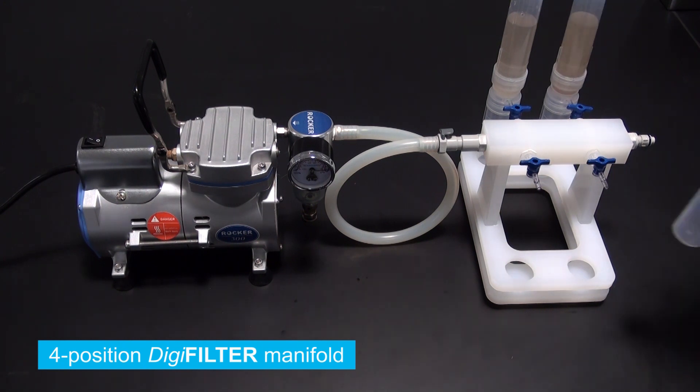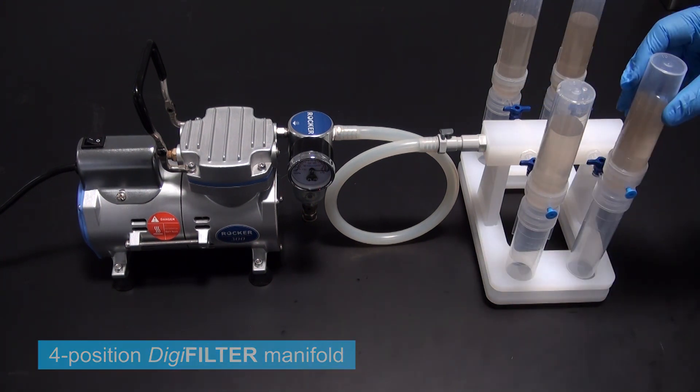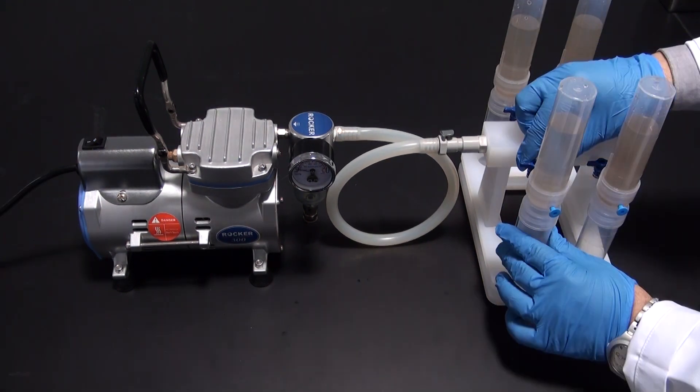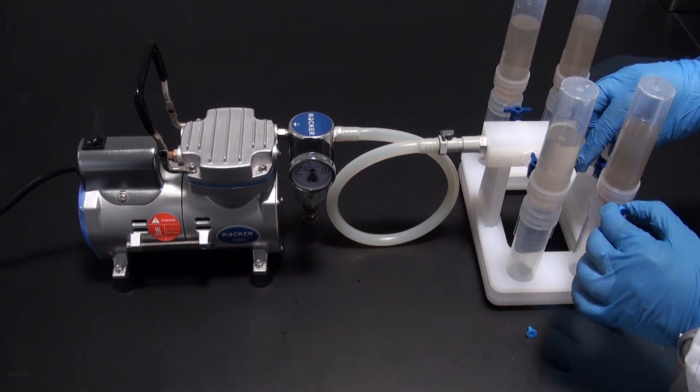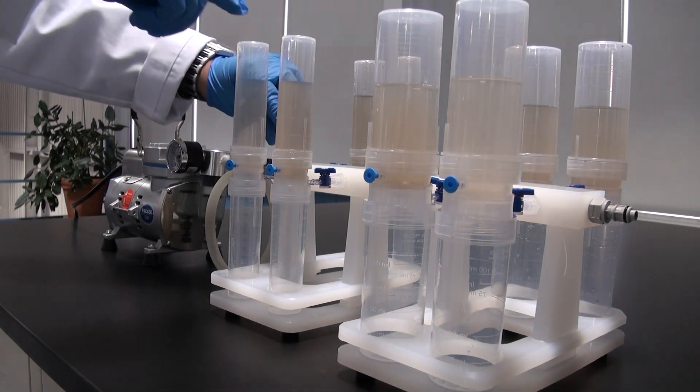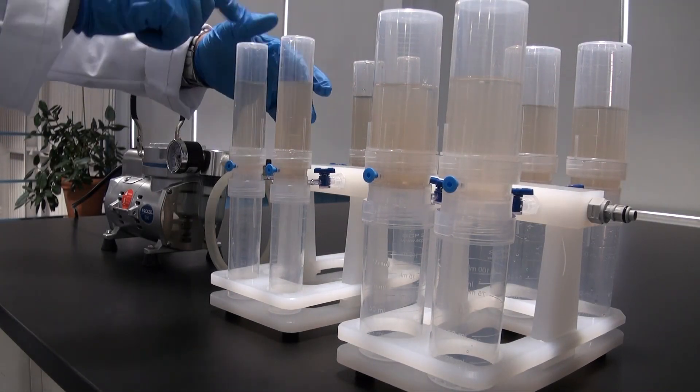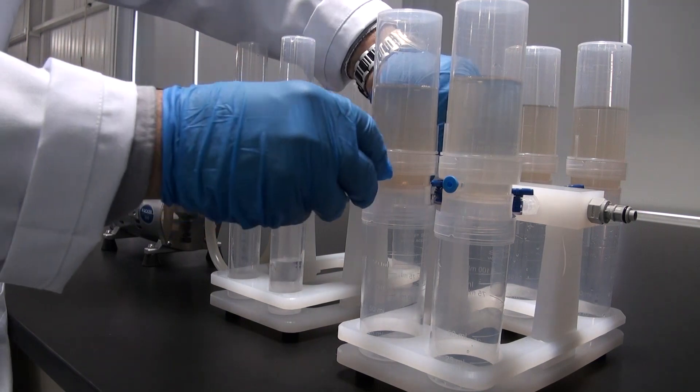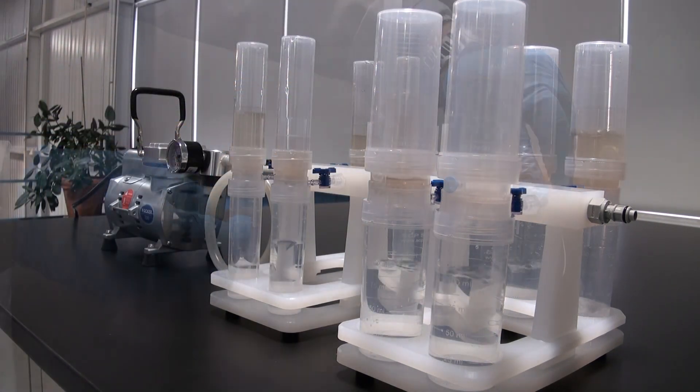Visible here is a 4-position manifold for 50 milliliter Digitubes. Here we have two 4-position manifolds connected together, one for 50 milliliter tubes and one for 100 milliliter tubes.